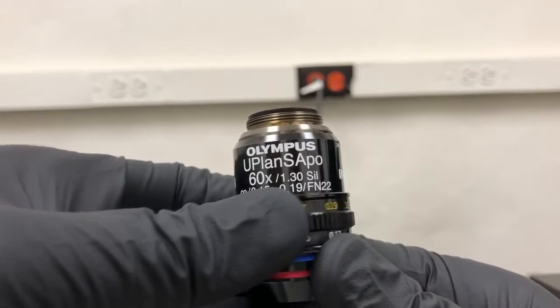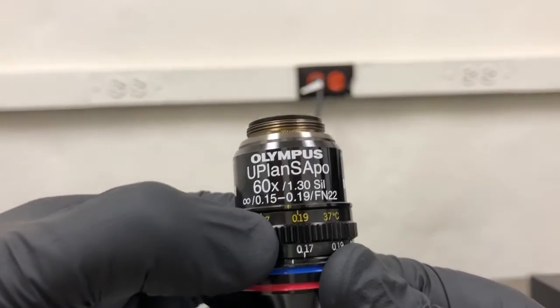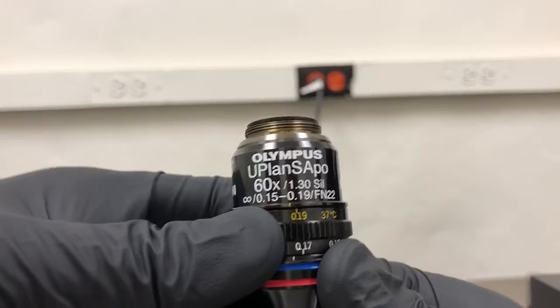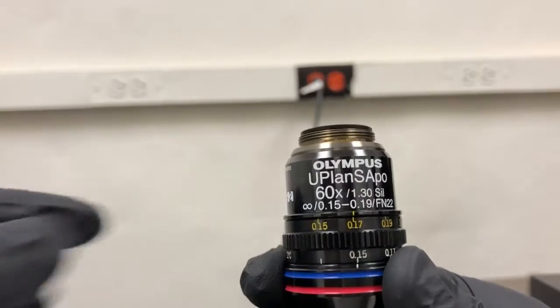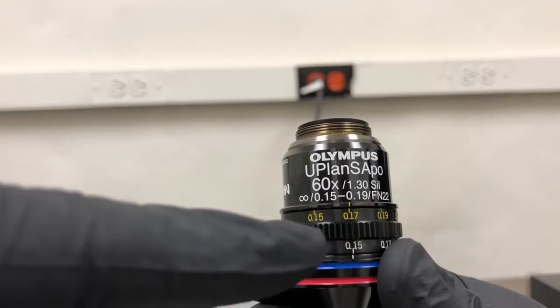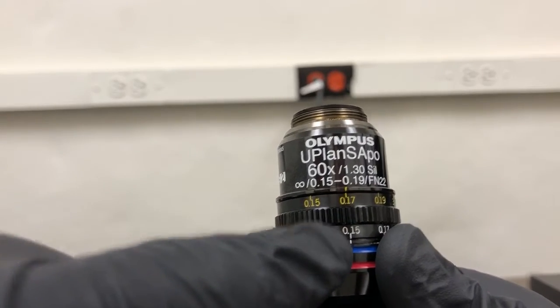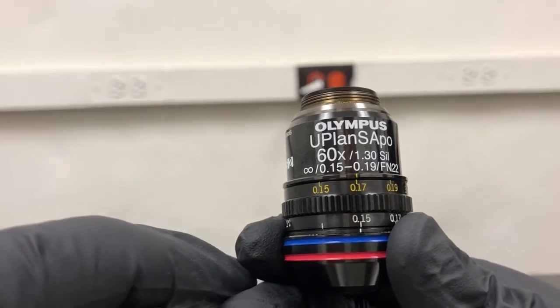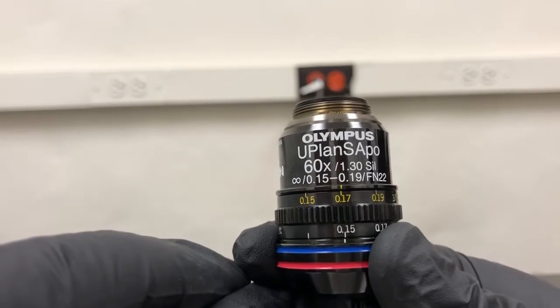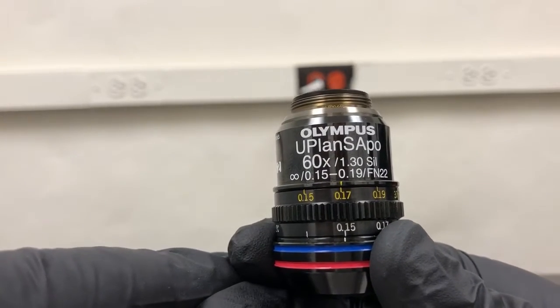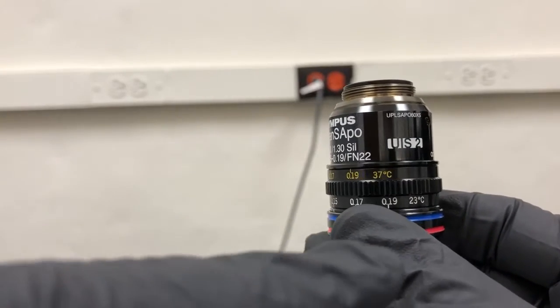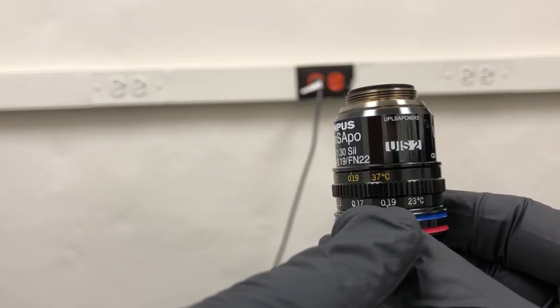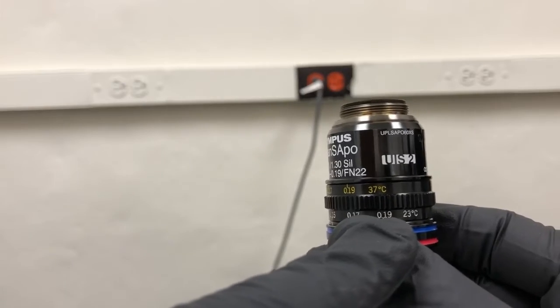When we move this, we can align different numbers either on the yellow set of numbers or on the white set of numbers to those lines. The way this works is the yellow set of numbers are for 37 degrees Celsius, and the white set of numbers are for 23 degrees Celsius, which is room temperature.